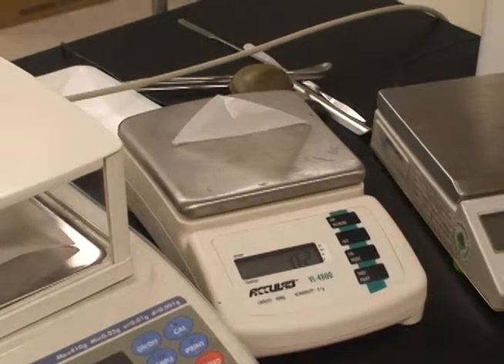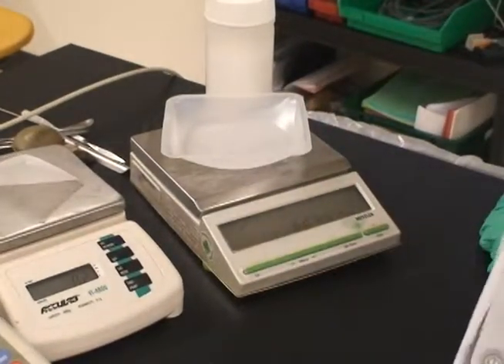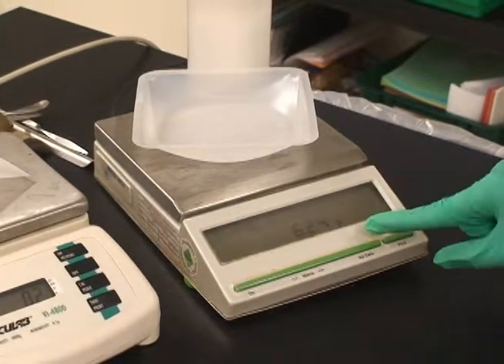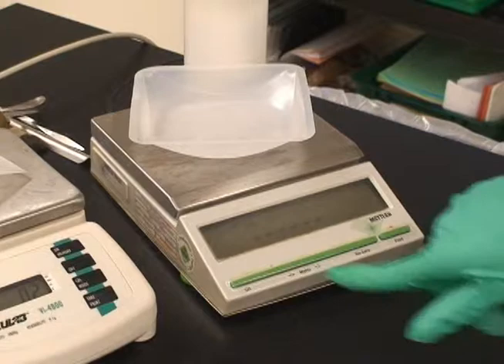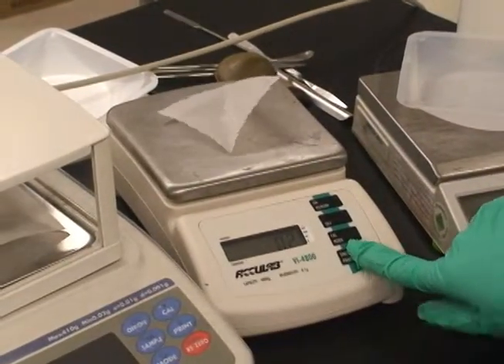Once you have put the weighing paper or tray onto the balance, it is time to zero out the balance. This is usually done by hitting tear, re-zero, or zero/T. This is almost always not the calibrate button — that does something different, and you should not have to worry about it.